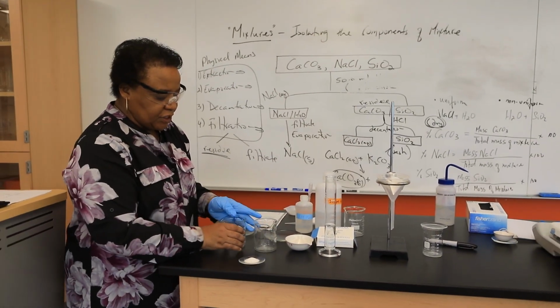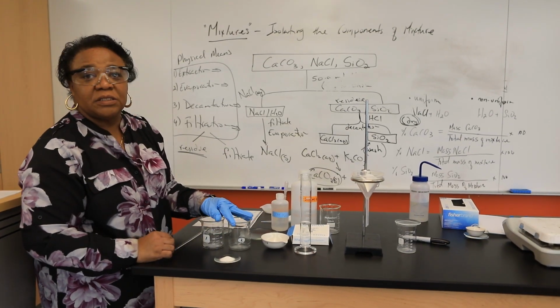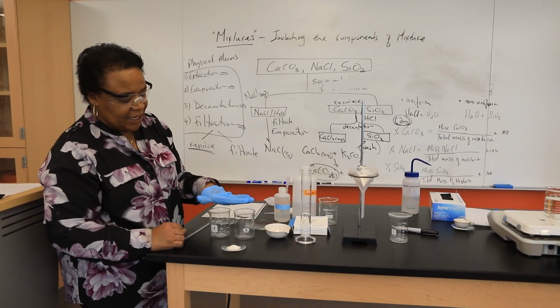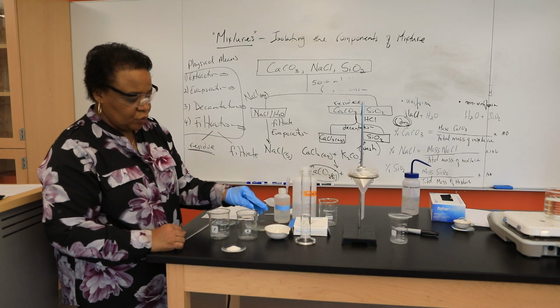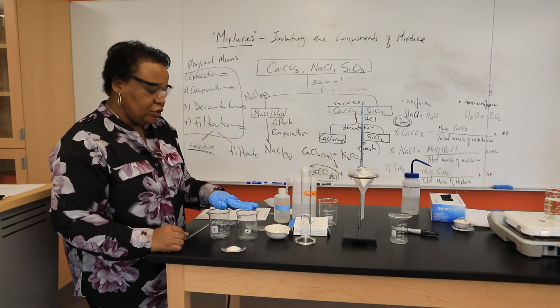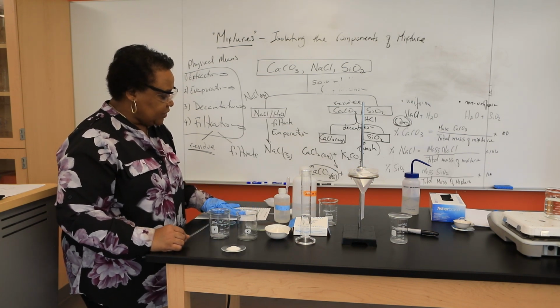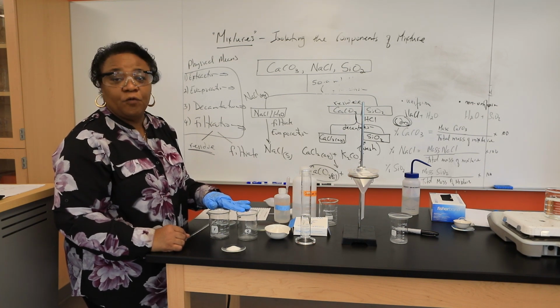Alrighty, so for our experiment. So if you're reading along with me, right, or if you've read this prior, so you could answer those pre-lab questions, you'll need to recognize that I'll need 2 beakers. Beaker 1, right, and beaker 2. So let me just go ahead and give you, of course, the information, right, that you'll need. You'll need to know the mass of each of these containers. So the mass of beaker 1 is 111.494 grams.